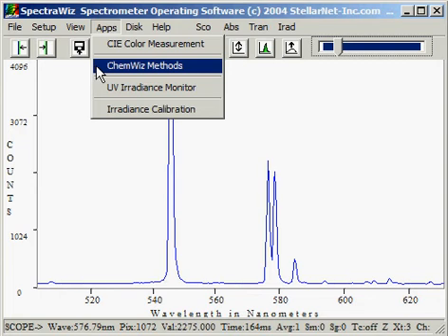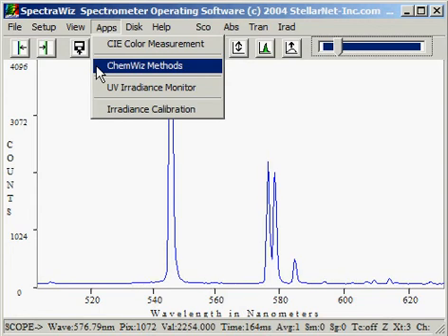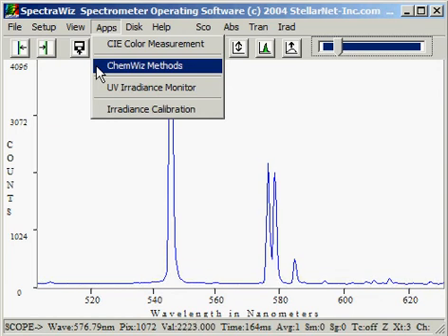ChemWiz methods allows us to relate concentrations to peak heights. Using known concentrations in cuvettes or dip probes, we can set up a method such that when we later recall it, it will allow us to identify the concentration of unknowns.